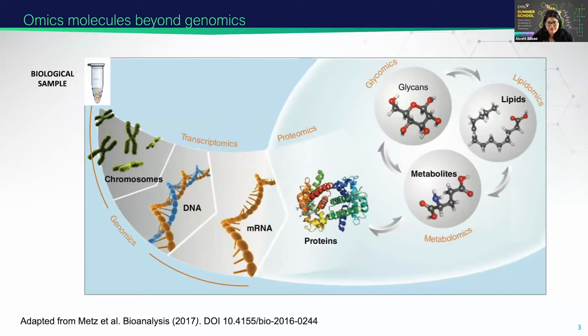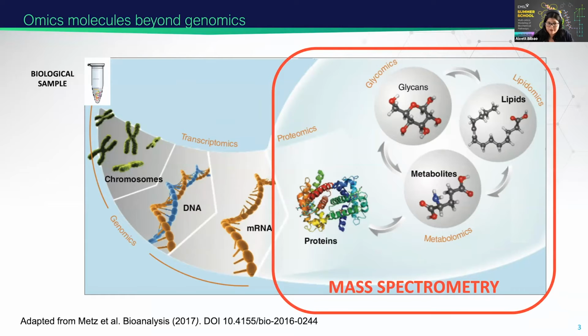In the flow of genetic information within a biological system, proteins and small molecules are essential to understand the dynamic changes at the phenotype level, particularly caused by external factors in the environment. Therefore, mass spectrometry is the method of choice, due to its sensitivity and throughput to study these molecules in complex systems.